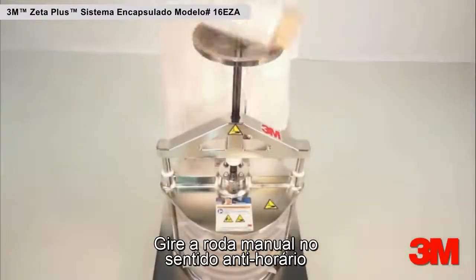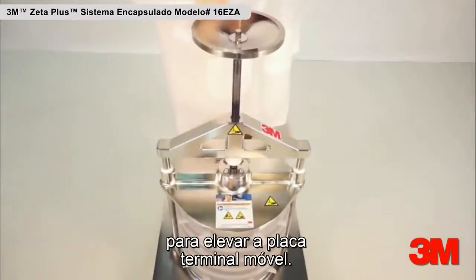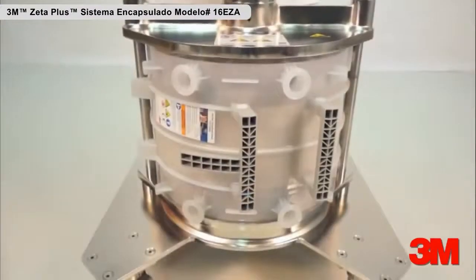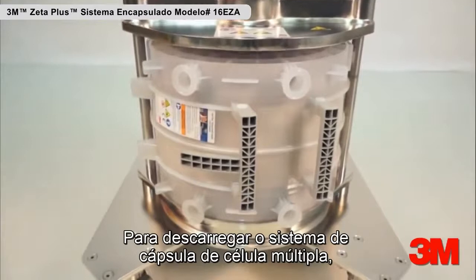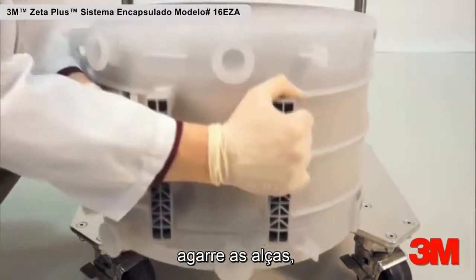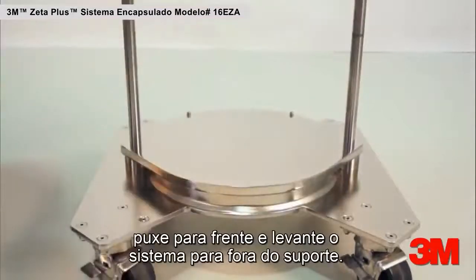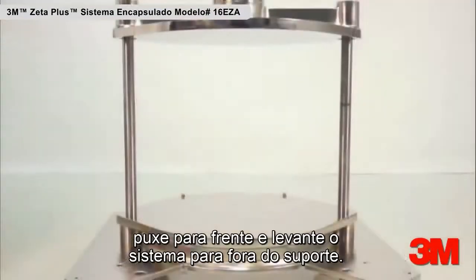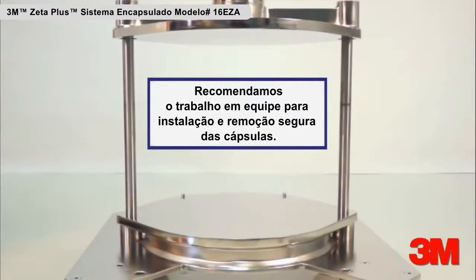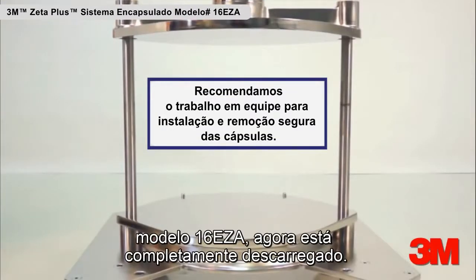Turn the hand wheel counterclockwise to raise the movable end plate upward. To unload the system when using a multi-cell capsule, grasp the straight and T-handles, pull forward, and lift the system off the holder. The Zeta Plus Encapsulated System model number 16 EZA is now fully unloaded.